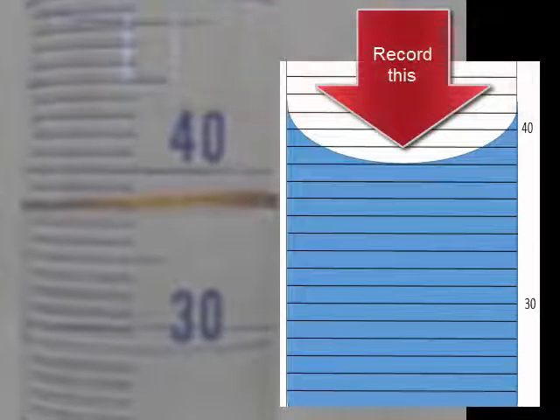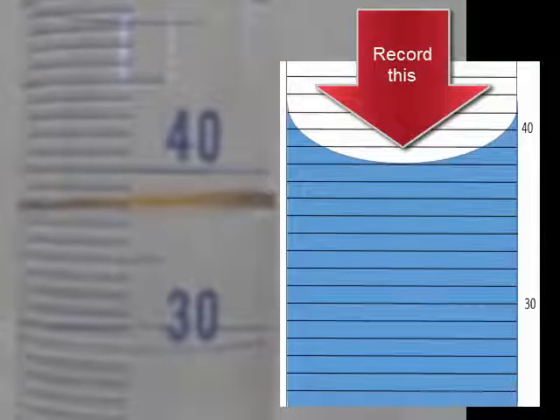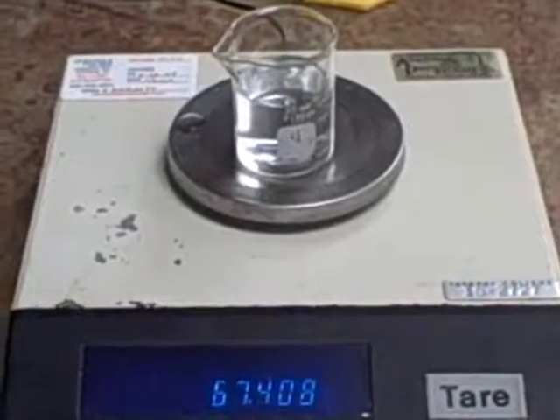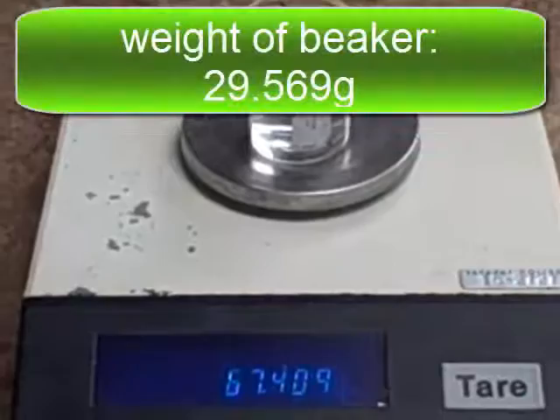Here is a second sample of salt water in the graduated cylinder. Record this volume to the correct decimal place. Now record the weight of this sample of salt water.